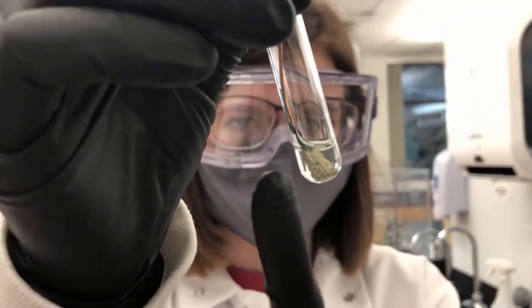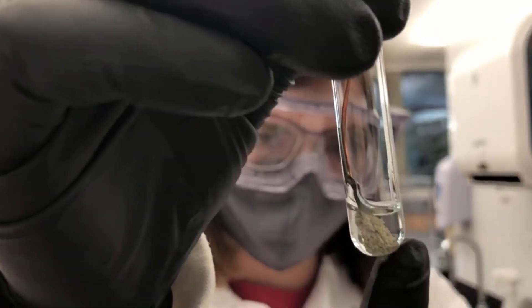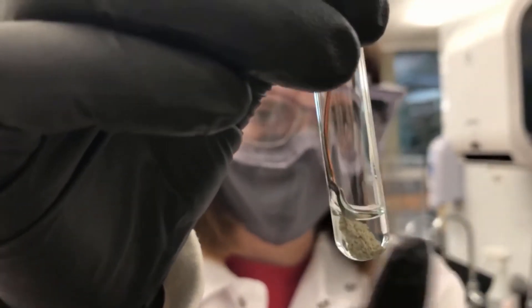Now that we've let it sit for a little bit longer, you can see even more of this silver buildup on the outside of the copper, and you can kind of see that the solution is starting to turn blue, which is the color of copper nitrate.